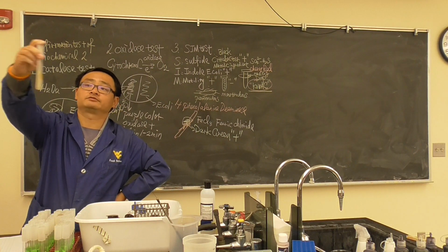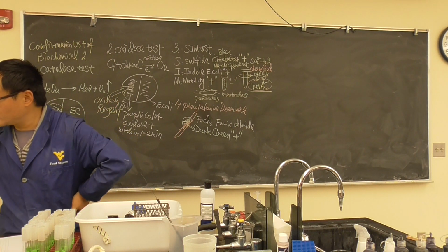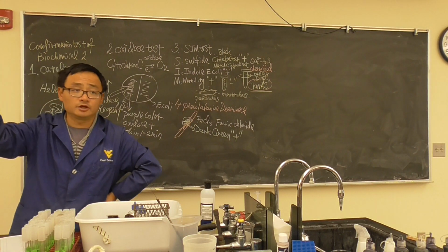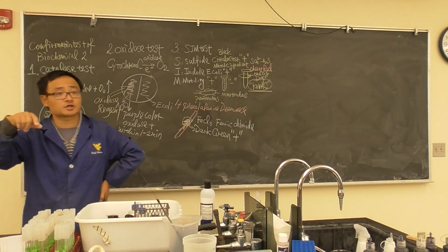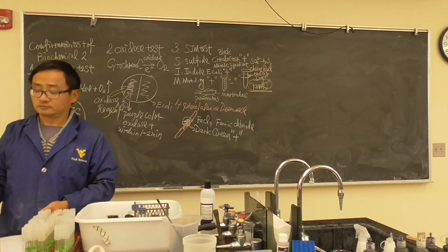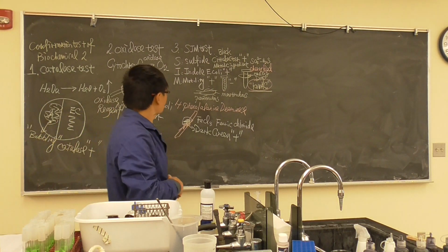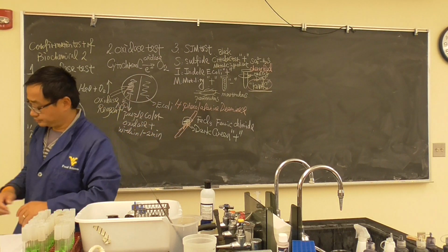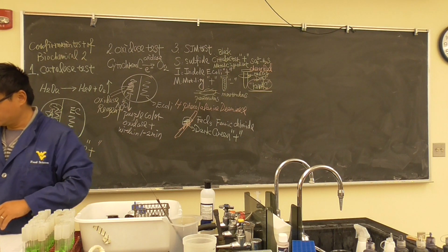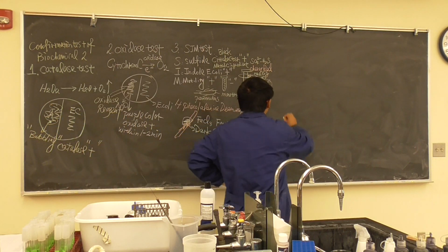Do you see it's positive? No, that's negative. You can go ahead to add for them. You have E. coli and you have Staphylococcus aureus to see which one is positive. Maybe they're all negative. Okay, you may get all negative results. Yes. Okay.